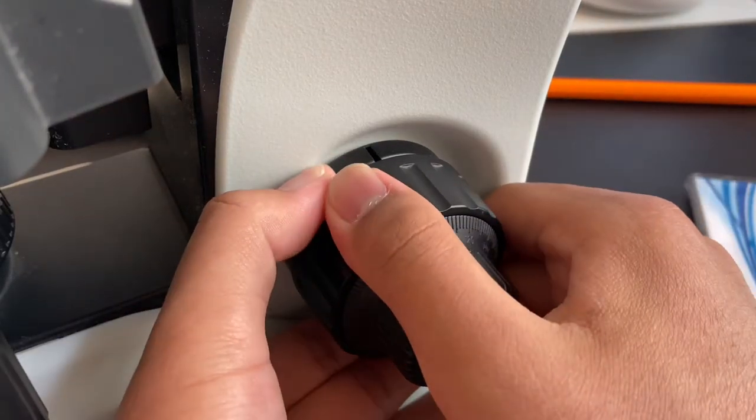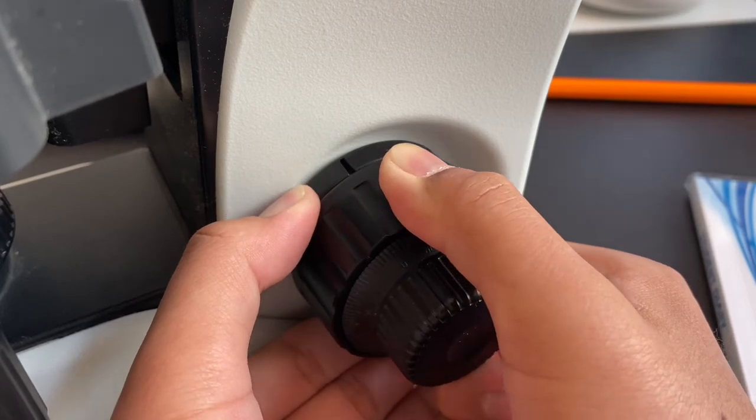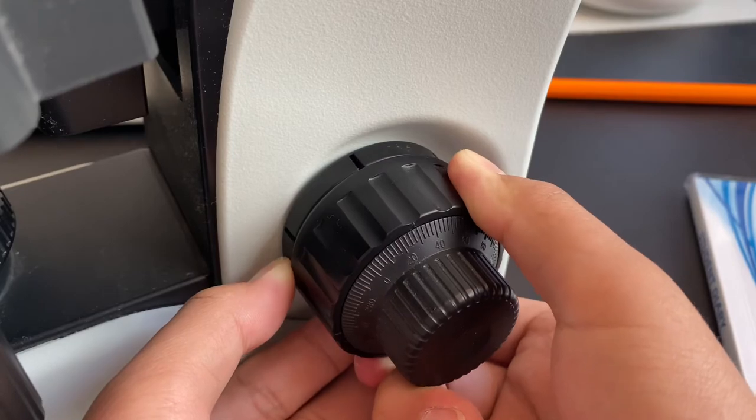You should turn the inner ring and the focus knob counterclockwise to loosen the tension of the focus knob of the microscope, as you can see right there.